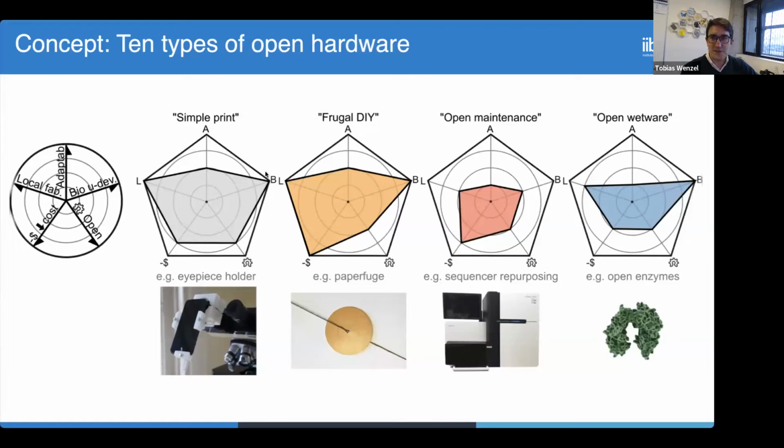Very understandable for a biology user, and they can make those modifications no problem. And yes, pretty much everything that you share is modifiable, even though the complexity is also limited. And it's pretty cheap. So this is a good thing, and I can just recommend you guys to print stuff for the lab.